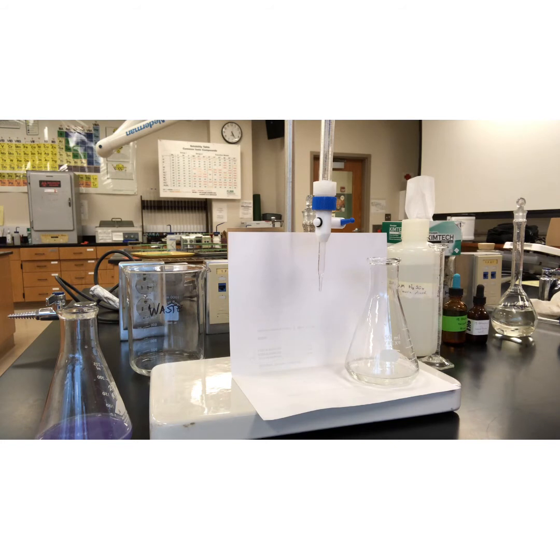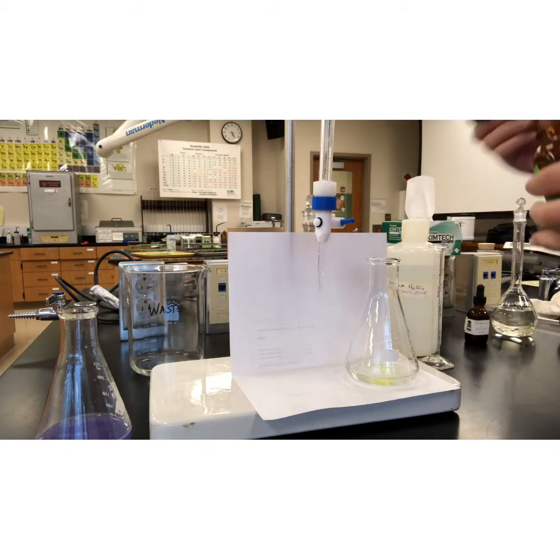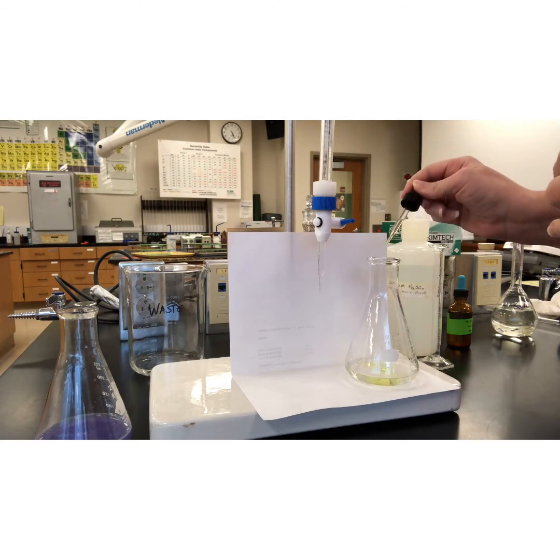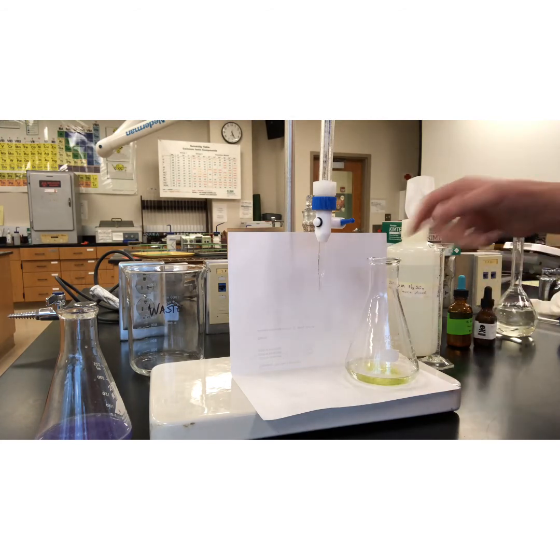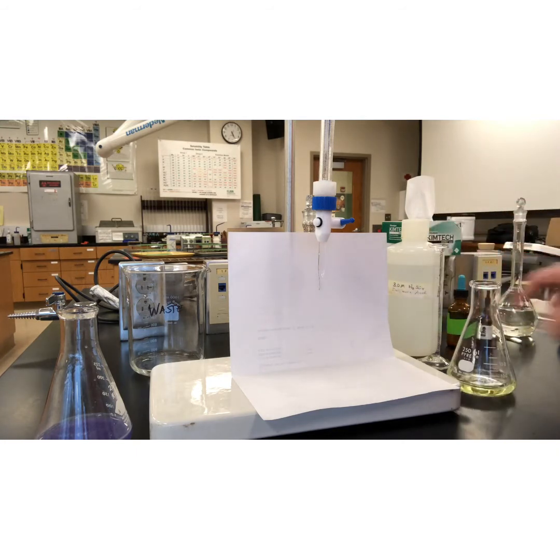I'm going to add my other 2 ingredients. 3 drops of the 1% potassium ferricyanide. 1, 2, 3. And 4 drops of my diphenylamine indicator. 1, 2, 3, 4. Swirl it. And note my initial volume.